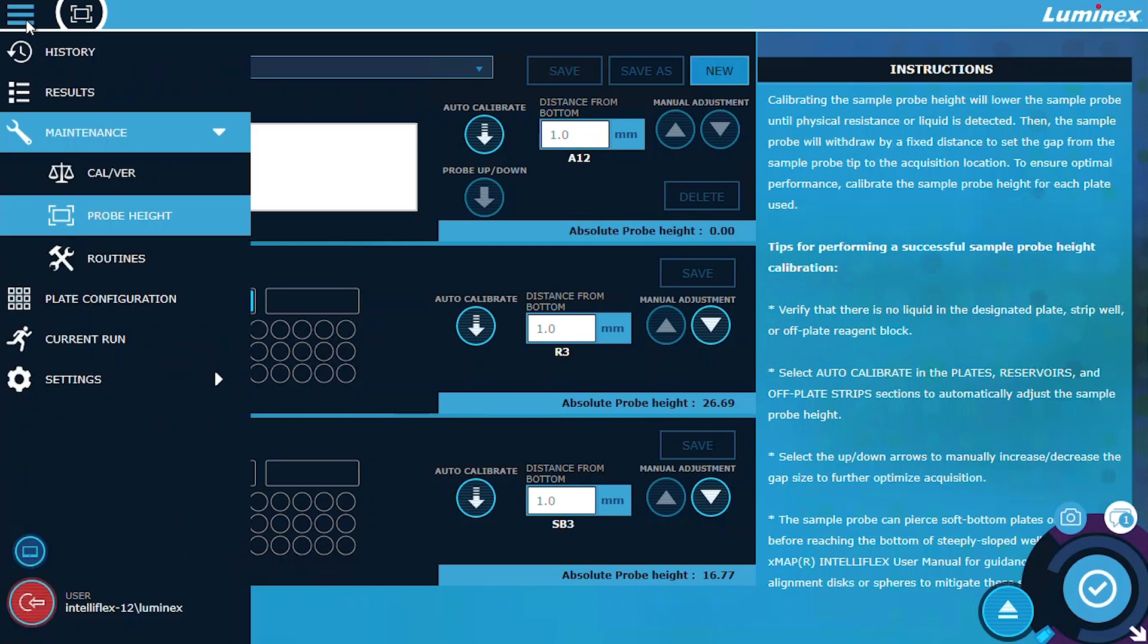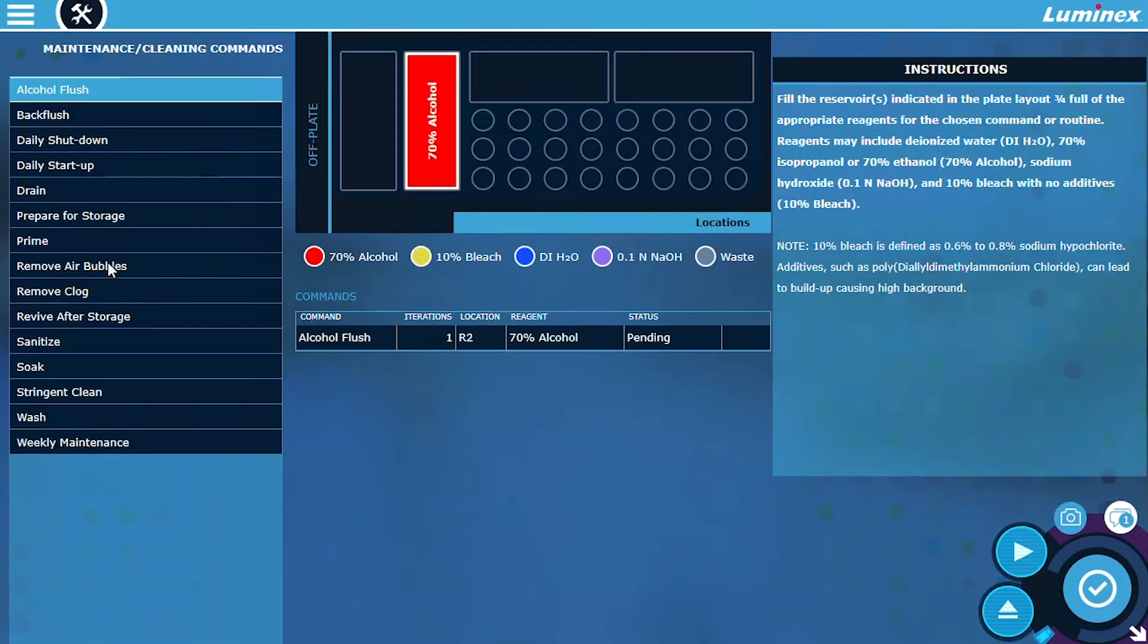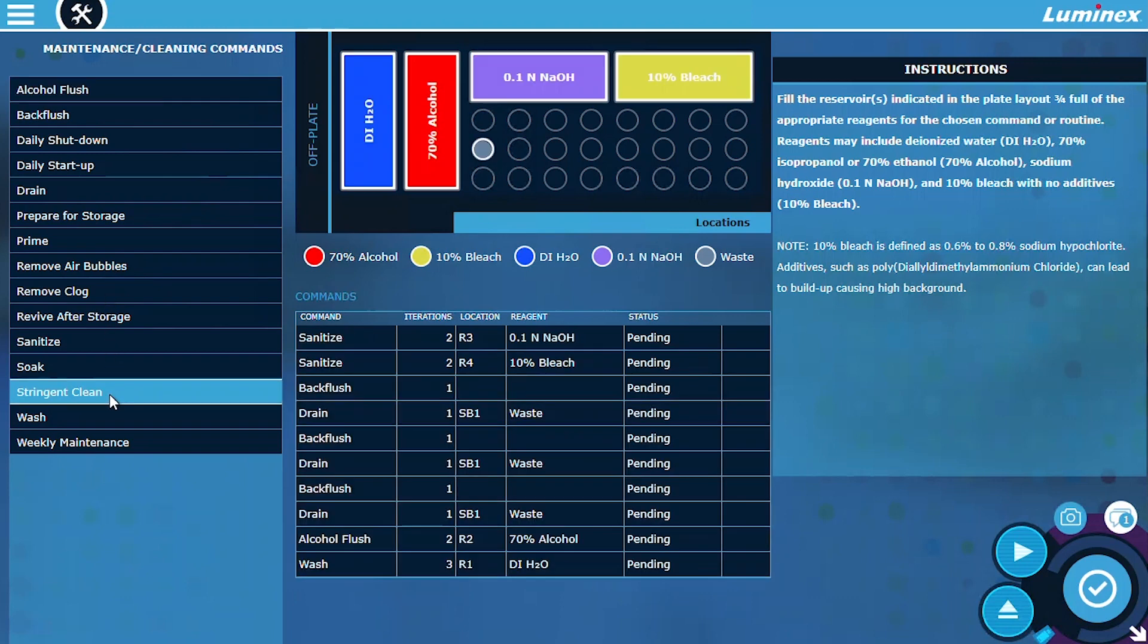To streamline your maintenance experience, Version 2.0 introduces the ability to perform a stringent clean routine using a single action directly from the routines page. Simply load the indicated reagents and select Play.